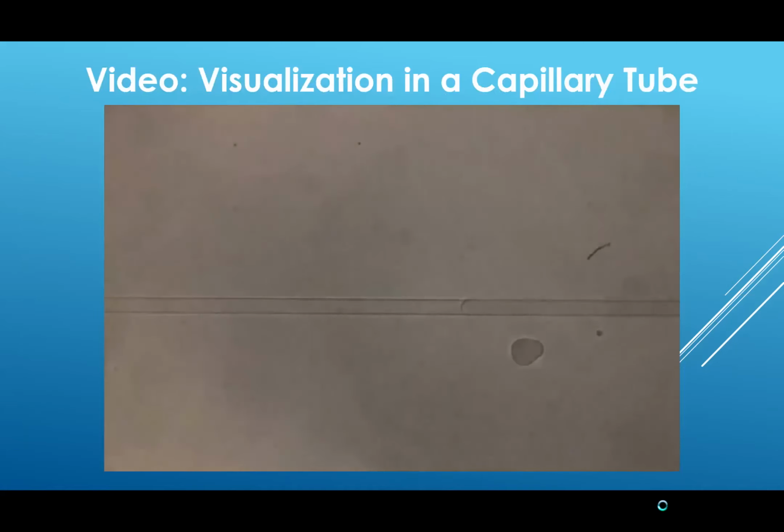Water vaporization in a capillary tube is shown in this video. The capillary tube has a diameter of 40 micrometers, and the vaporization temperature of water in this capillary tube is 76.6 degrees Celsius. Compared with the boiling point temperature of water in bulk phase, which is 97.8 degrees Celsius in Edmonton, the boiling point is lowered over 20 degrees Celsius in the capillary tube.